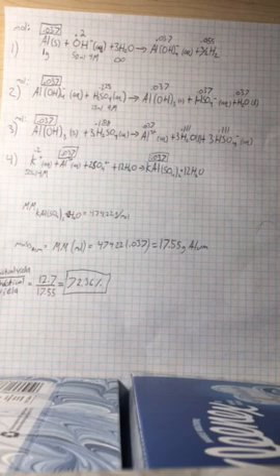And then when we do the percent yield, which is the actual yield divided by theoretical yield, which is 12.7 divided by 17.55, which is 72.36% yield. The discrepancy in the theoretical and actual yield can be due to many factors during the synthesis.